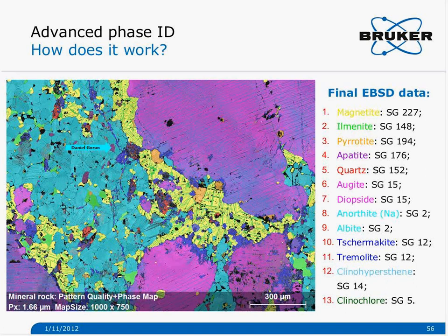That's actually a very good question, because every time I showed the integration between the EBSD and EDS, or gave a talk, I would say maybe all the time I got questions saying, yes, but the spatial resolution of the EDS technique is pretty different compared to the one of the EBSD.